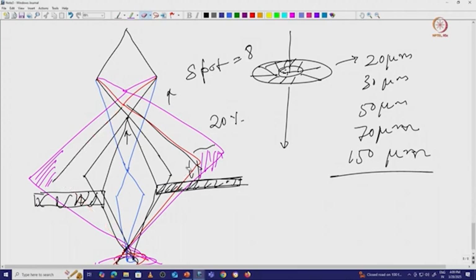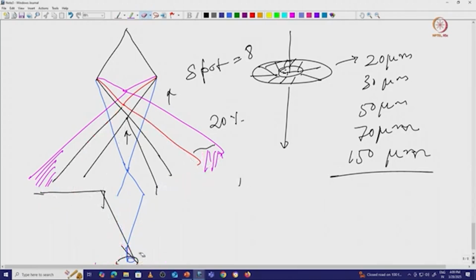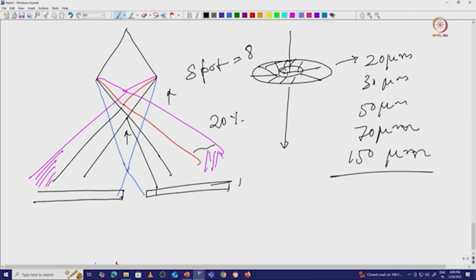Now if we use a very short aperture, something like that, I will just erase this one. So if I use a very short aperture, something like that, I am even trying to block this partially, and allowing only those electrons which are within that range. So I am keeping an aperture size something like that, and I am allowing only the electrons which are coming within this range.